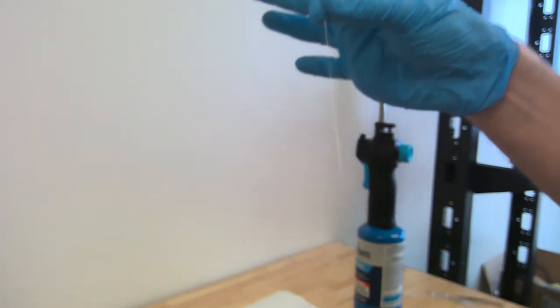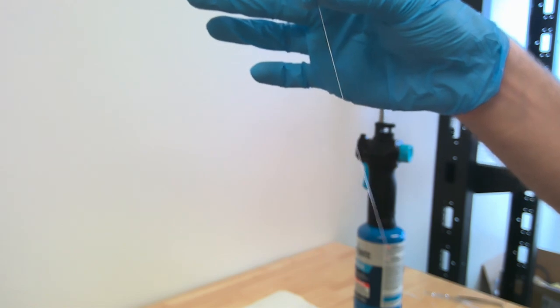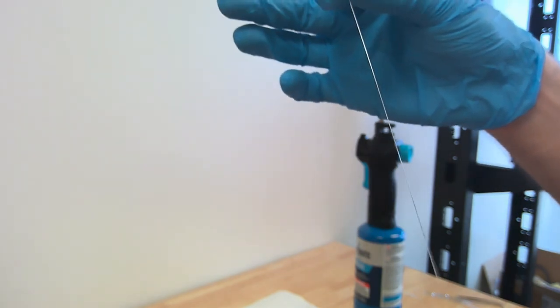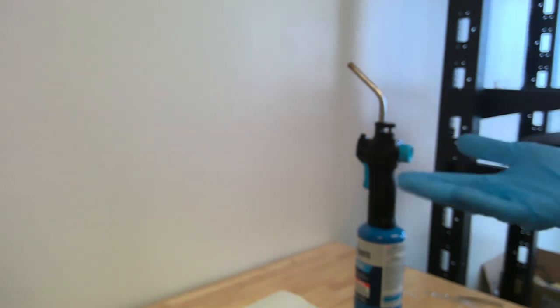Finally, we've prepared and showed how to prepare a TLC capillary spotter. This can be used to sample small volumes of liquid, and it can be used for thin layer chromatography monitoring of your reaction. So this is an overview and guide that I'd like you to reference throughout the semester if you're ever unsure how to prepare some of these common pieces of organic glassware, or if you need to re-prepare them after our organic glassware laboratory.